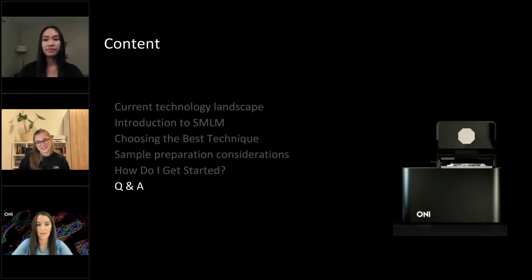And then the next question is from Karsten, and Karsten is asking, what are available laser wavelengths and what are typical laser powers? Right, so the available ones on the Nanoimager are 405, 488, 560, and 640. And as far as laser powers, for dSTORM you want high laser powers. Ours go up to around 250 to 300 milliwatts at 100%, though you can probably use like 50% of that when you're doing your dSTORM experiment. But you just want to make sure that you have enough output at the fiber for you to do this experiment.